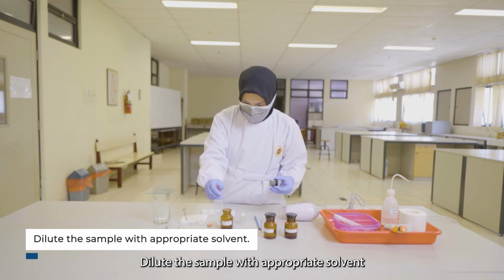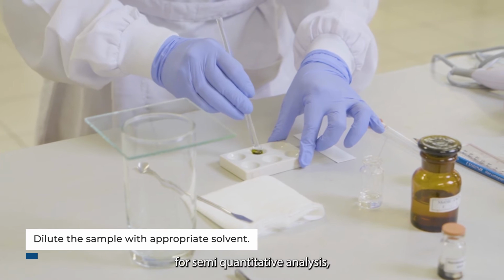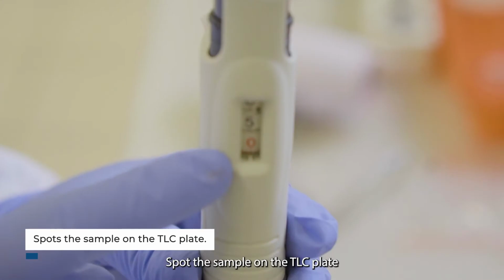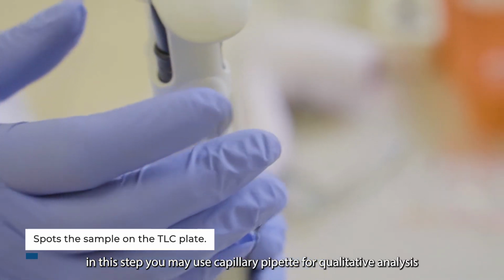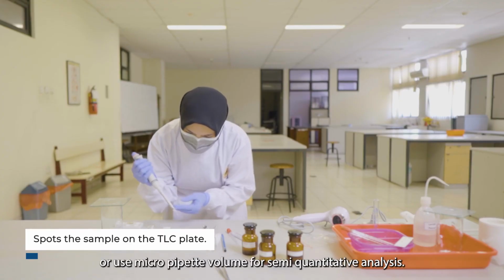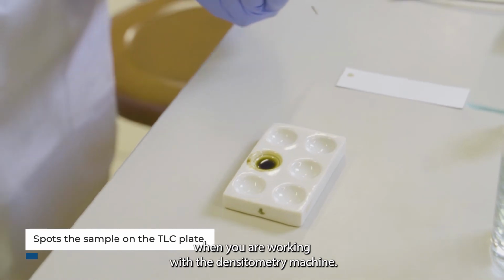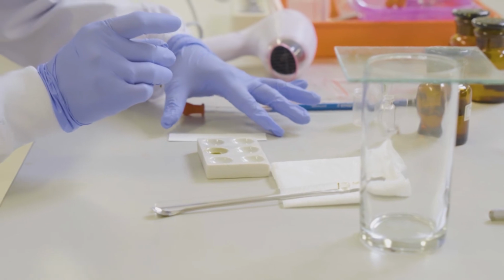Dilute the sample with appropriate solvent. For semi-quantitative analysis, record the volume of dilution you made. Spot the sample on the TLC plate. In this step, you may use a capillary pipette for qualitative analysis or a micropipette for semi-quantitative analysis. It is also possible to employ a Linomat when you are working with a densitometry machine.